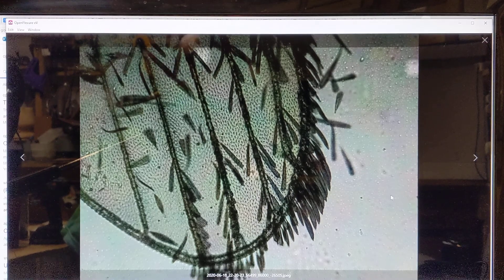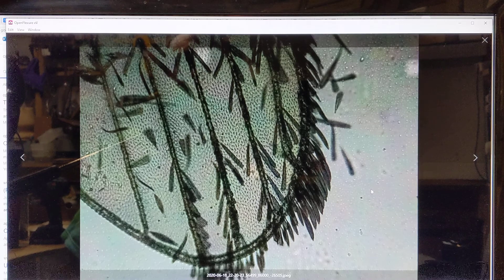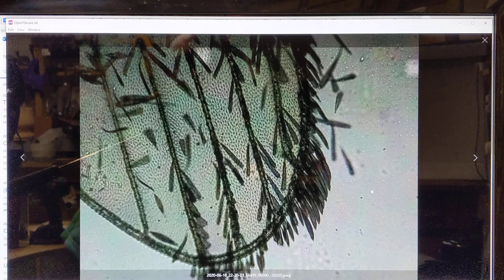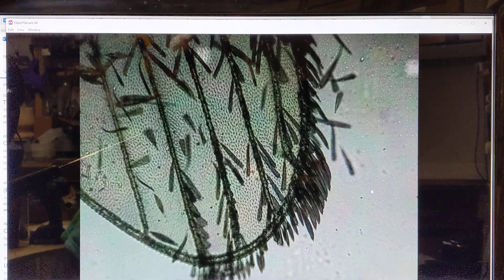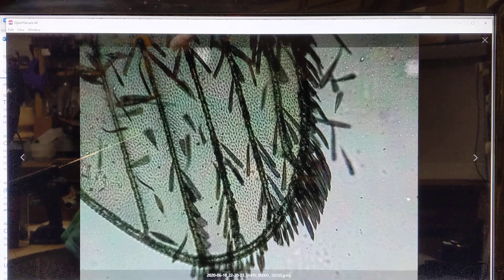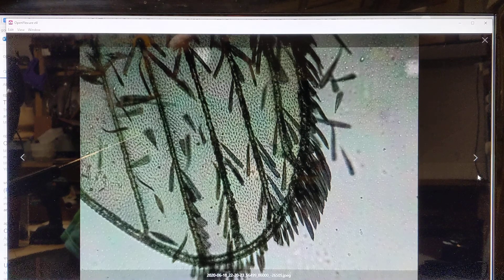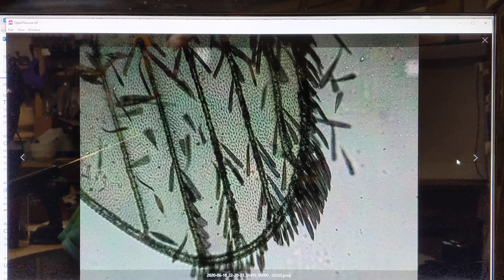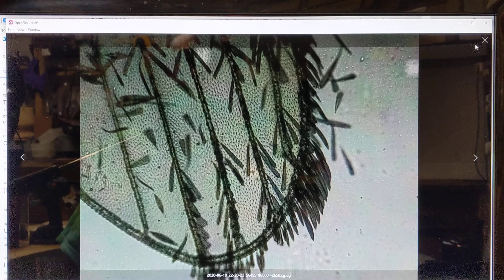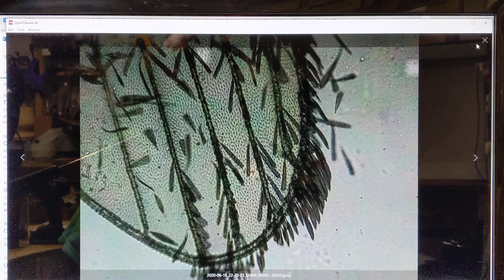This is the OpenFlexure microscope. It costs approximately $50 to build. The most expensive item is the Raspberry Pi and the Raspberry Pi camera — the rest of it is 3D printed, so whatever the cost of your 3D printing is.